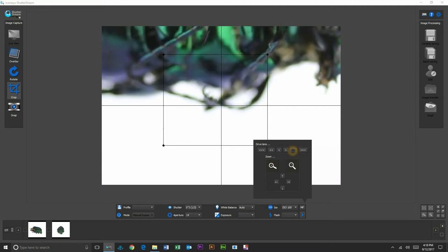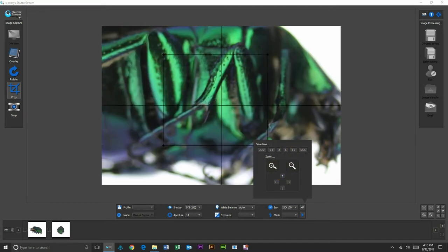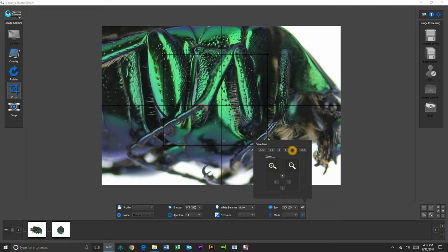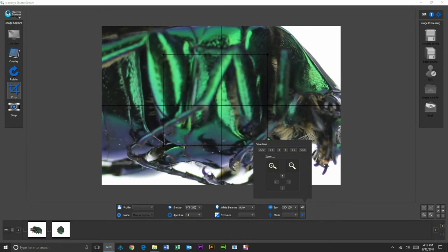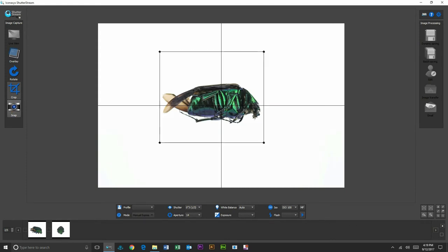So we're going to save this a little bit further away, and let me just view it closer here. Looks pretty good there. Okay, so that'll be our focal point for our third image.